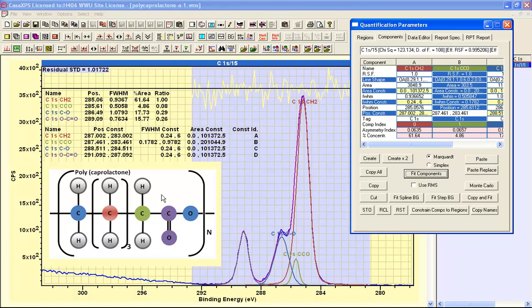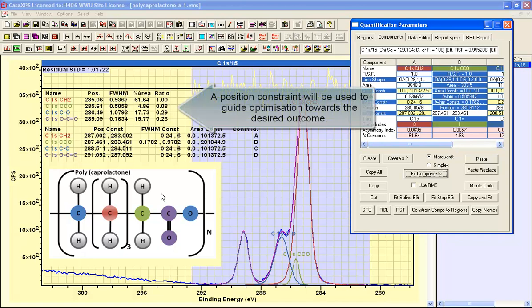So we need to see if we can actually recover the polycaprolactone relative intensities by introducing some constraints into the peak model.